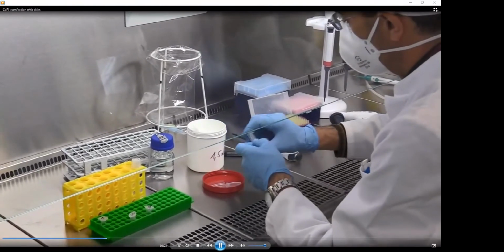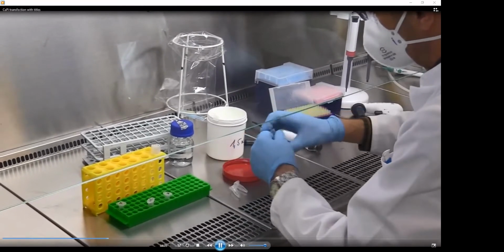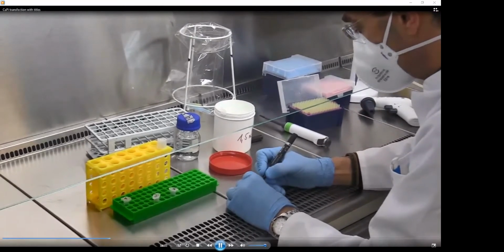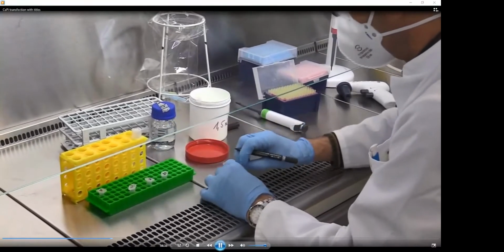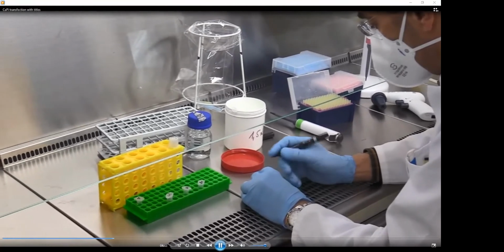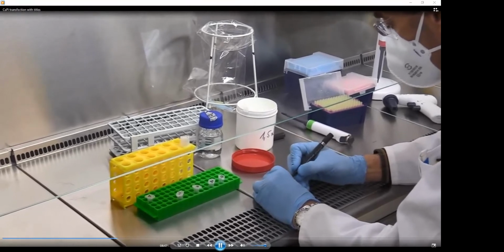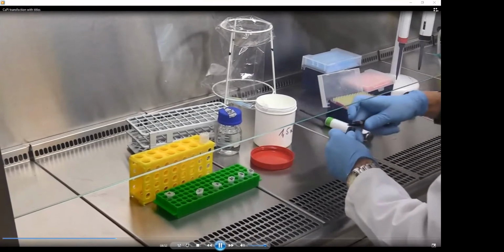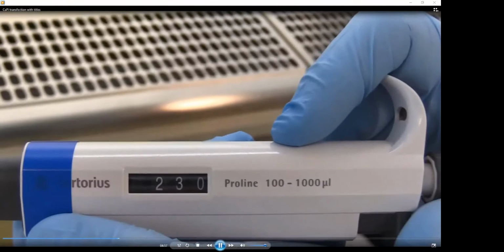And then from this one, we will make 3 different samples, which is the B1, B2, and B3. B1 is that one where will be only the empty vector DNA. B2 is that one where we overexpress TIS7. In this case, it's a MYC-HIS construct, which gives us the opportunity to detect the overexpression in Western blot using anti-MYC or anti-HIS tag antibodies. So if you want to prove it.